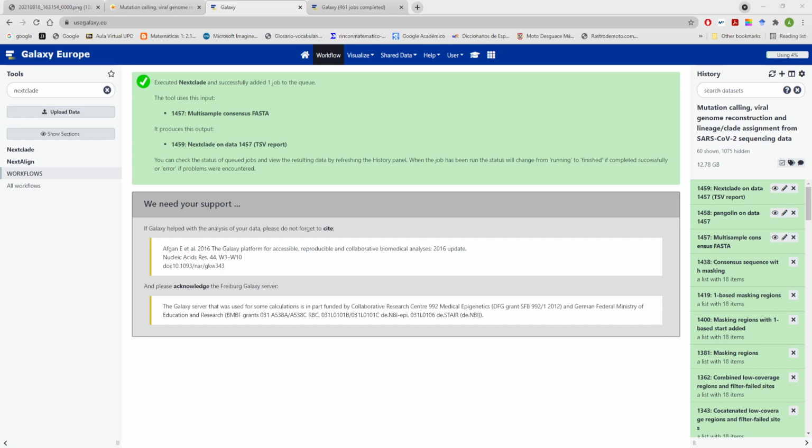The conclusions drawn will be provided in annexed documents.